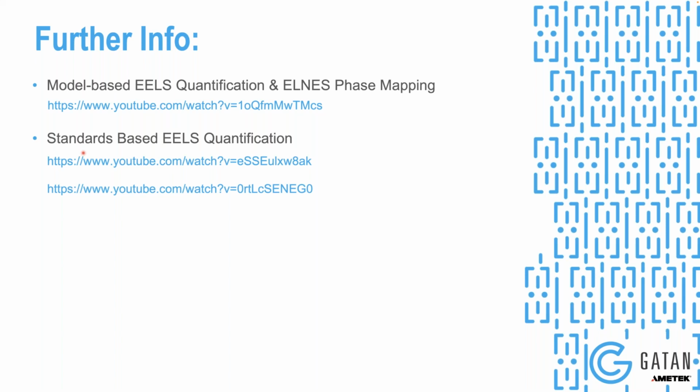It's pretty straightforward. Yeah, but it is critical to account for plural scattering, especially when you're using external standards like you might download from a database or from a different sample that you're using.